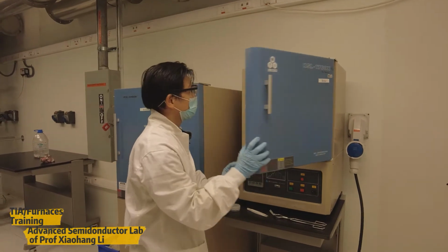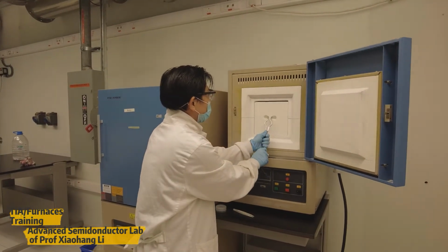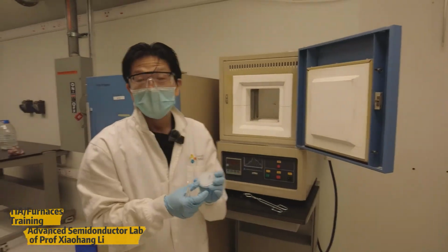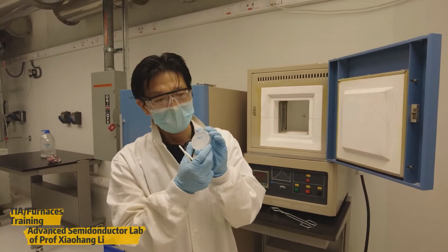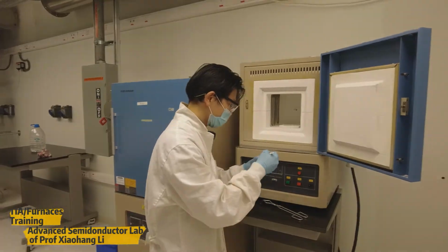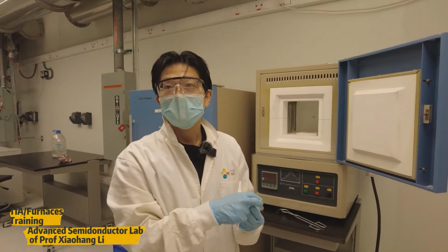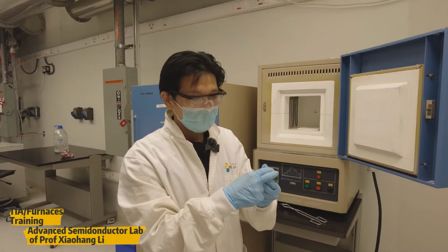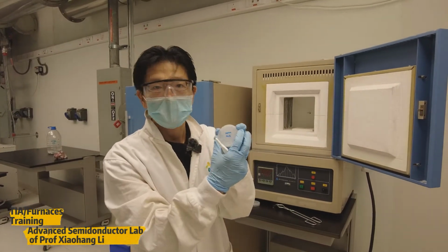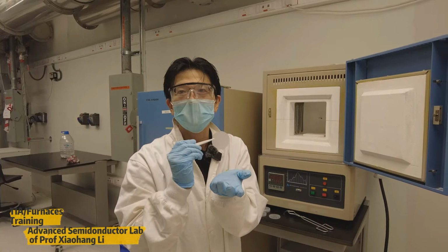First, open the chamber. Use the clamp to open this shield. Then we will put our beta gallium oxide, which is deposited by PLD. Put this sample into the oven first. This is our 2-inch gallium oxide sample. We will use another sapphire to cap the samples to prevent surface damage. So here we use a sapphire substrate. Use another 2-inch wafer to put on top of the samples.